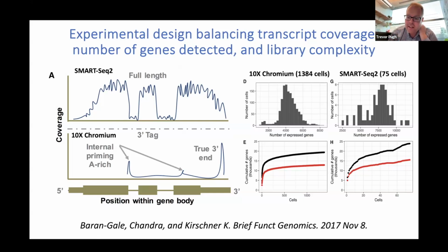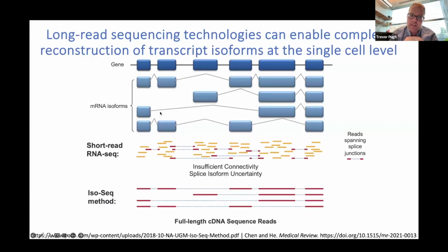But your point is correct. You don't actually know the linkage across those exons. That's where long reads like PacBio come in, where you have a gene and these differentially expressed exons. With short read sequencing, you're right, it's very hard to know exactly which transcripts contain which exons. But with longer read technologies, you get one long read and it lets you stitch all these exons together.